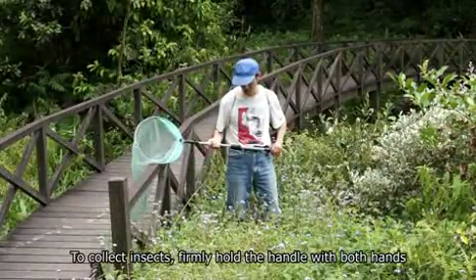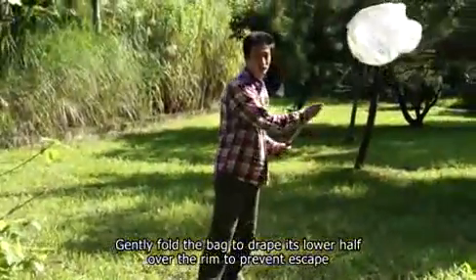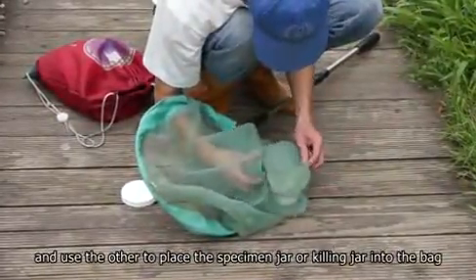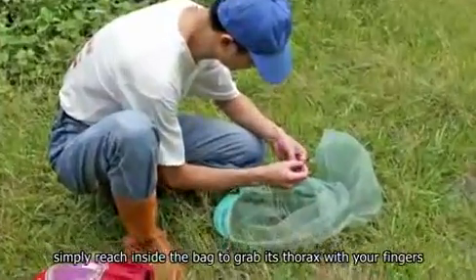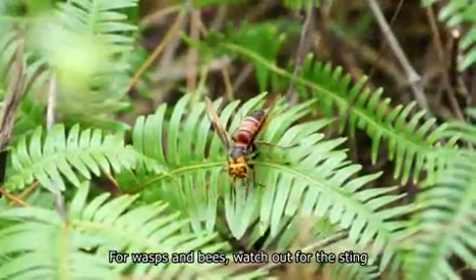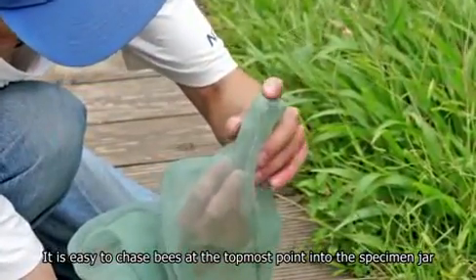To collect insects, firmly hold the handle with both hands. Point and swing the opening at targets following a shallow figure-eight pattern. Gently fold the bag to drape its lower half over the rim to prevent escape. Check the insects inside the bag. Hold the bag with one hand and use the other to place the specimen jar or killing jar into the bag and chase insects into it. For a butterfly, simply reach inside the bag to grab its thorax with your fingers, remove it from the net, and place it inside the triangular envelope. For wasps and bees, watch out for the sting. Wasps and bees tend to stay upward — hold the net so the opening faces downwards, making it easy to chase bees at the topmost point into the specimen jar.